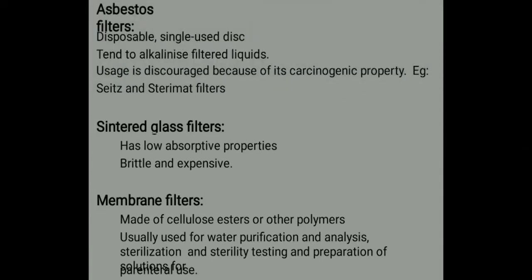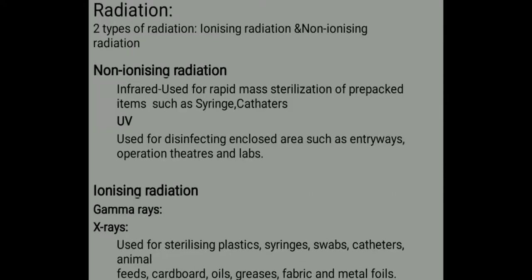Next we have membrane filters. Mostly these membrane filters are used and they are more effective. Made up of cellulose esters or other polymers, usually used for water purification and analysis, sterilization and sterility testing, and preparation of solutions.